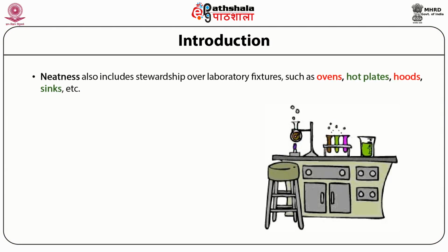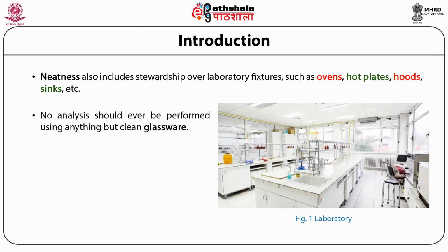Neatness also includes stewardship over the more permanent laboratory fixtures such as ovens, hot plates, hoods, sinks, and the benches themselves. No analysis should ever be performed using anything but clean glassware.